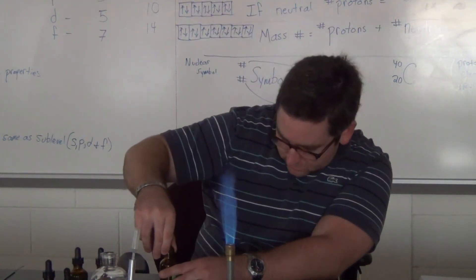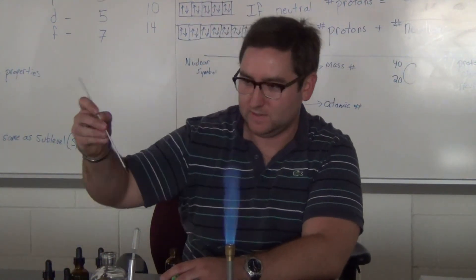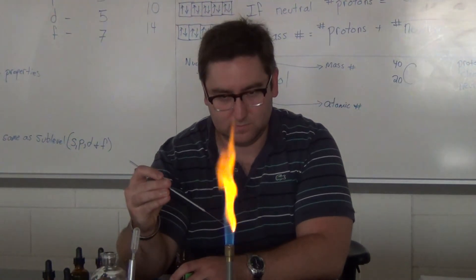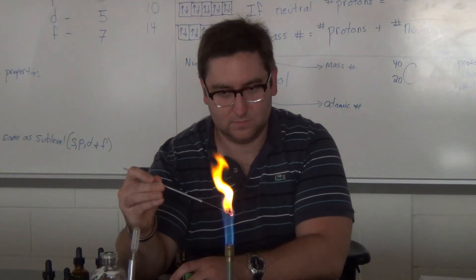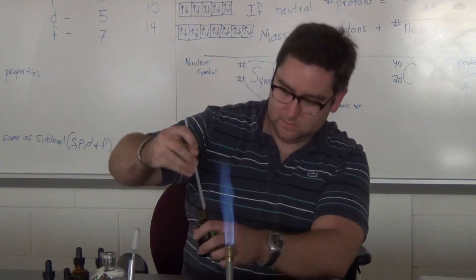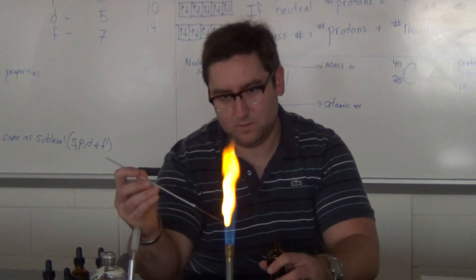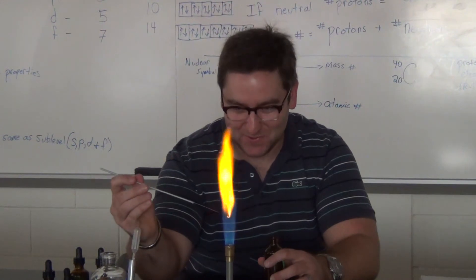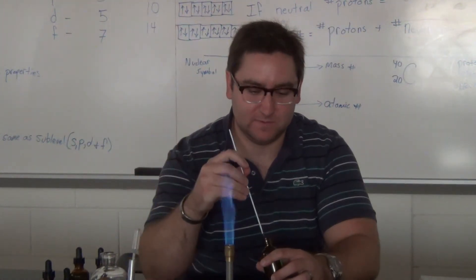And this is salt — old table salt, sodium chloride. So first let me clean it. I can keep this one in there as long as we want. This one's the same color as the metal that burns, so it's going to be that orange.